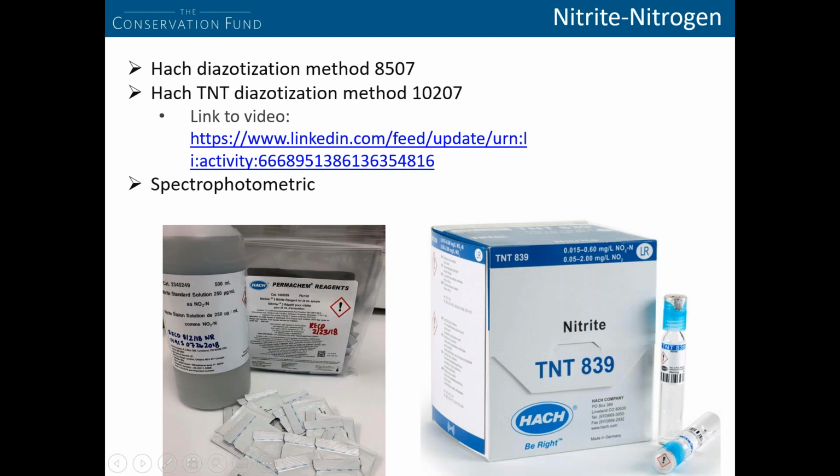We use the diazotization method for nitrite nitrogen analysis. In this method, nitrite in the sample reacts with sulfanilic acid to form an intermediate diazonium salt. This then couples with chromotropic acid to produce a pink color complex that's directly proportional to the amount of nitrite present.